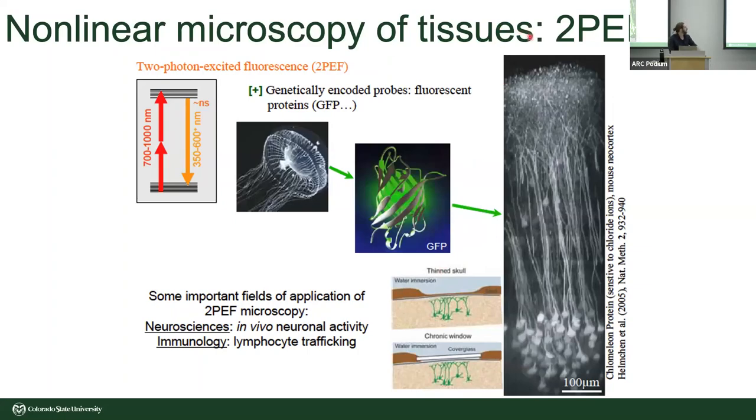methodologies. So 2-photon fluorescence is beneficial for a number of reasons, one of which is that the emission spectrum is the same. Whether I excite this molecule with a 1-photon source or a 2-photon source, I'm still getting the same emission spectrum. I don't have to change the protocol for my specimen preparation, anything along those lines. It's particularly useful if you've already got transgenic mice, for example, that you've been breeding with certain fluorophores and you don't want to have to change that whole population.